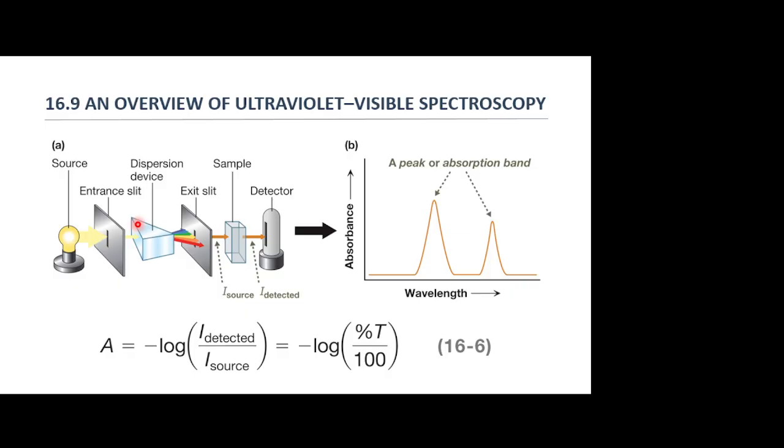What this does is it keeps things from scattering off and causing you to have a bunch of blurred images. You guys ever seen a flashlight, how it has rings? That's because that doesn't do a slit. You lose a lot of the intensity, but it narrows it and focuses your beam.